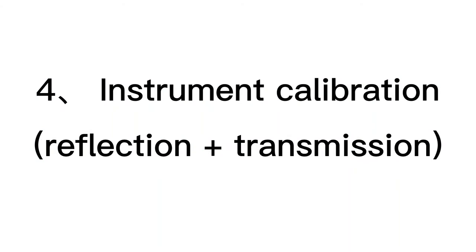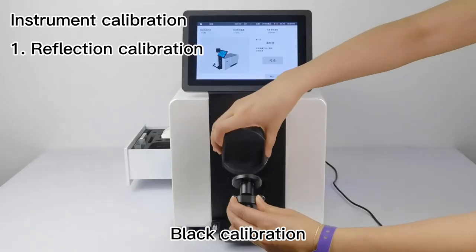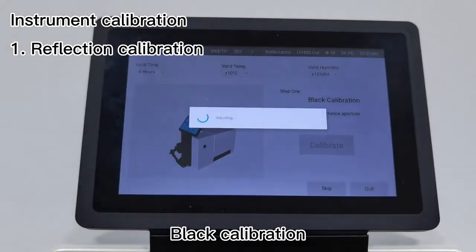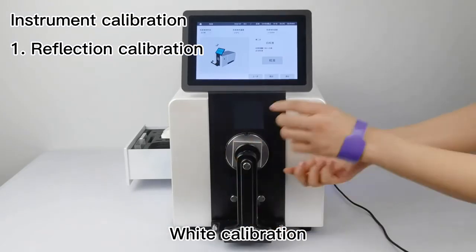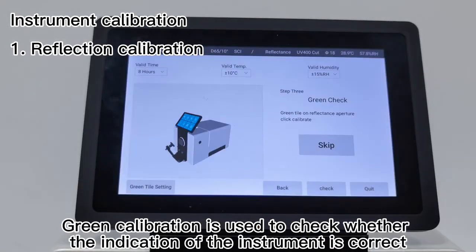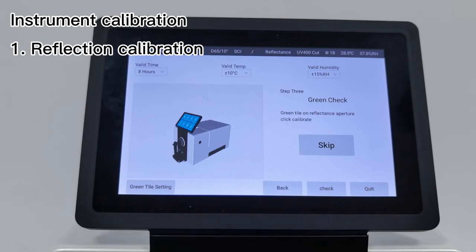Module 9 - Calibration: The instrument can be calibrated at any time for instrument calibration - black calibration, white calibration, and green calibration. Green calibration is used to check whether the indication of the instrument is correct. You can skip the green calibration.